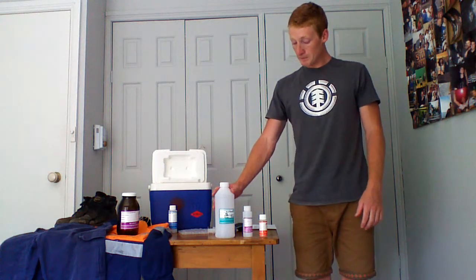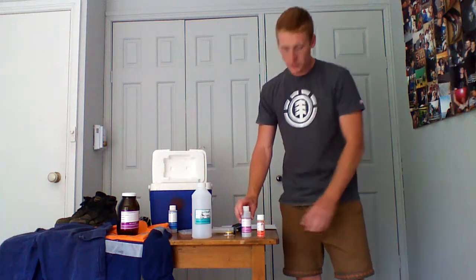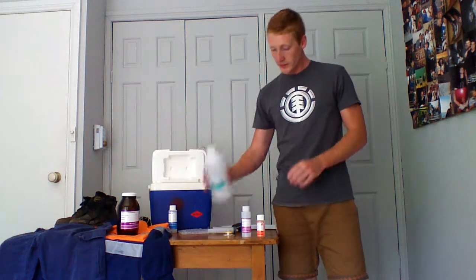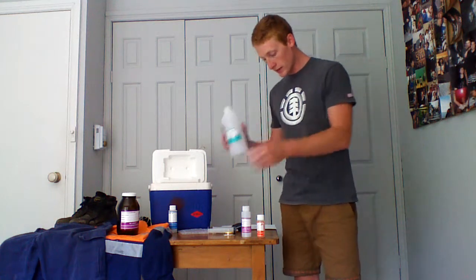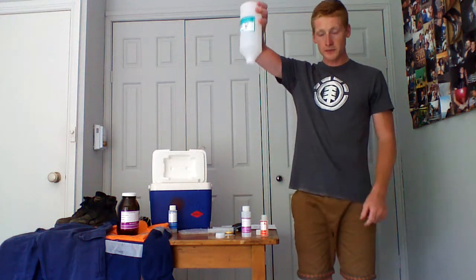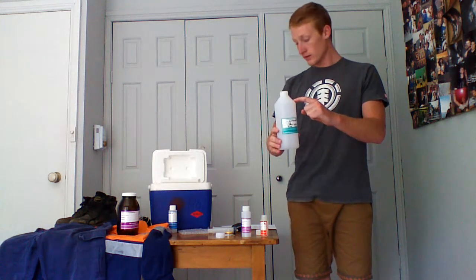So these are our 3 bottles we've all filled out with details. These 2 containers contain chemical preservatives that we do not want to lose. So we must decant from our larger bottle into these 2. So filling up with this, we'll fill up water by holding at the base of the bottle. Upside down we plunge into the water, slowly tilt it upstream, fill the water bottle. Don't fill it all the way up, to about here. From here we decant into the bottles with preservatives in there.